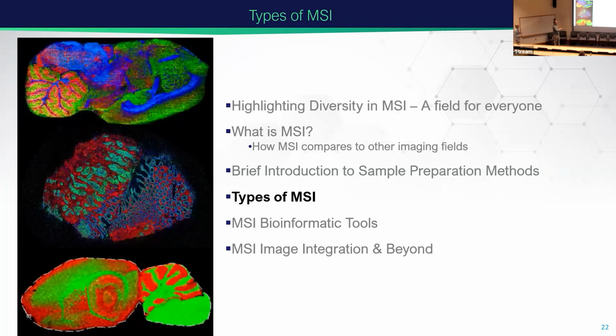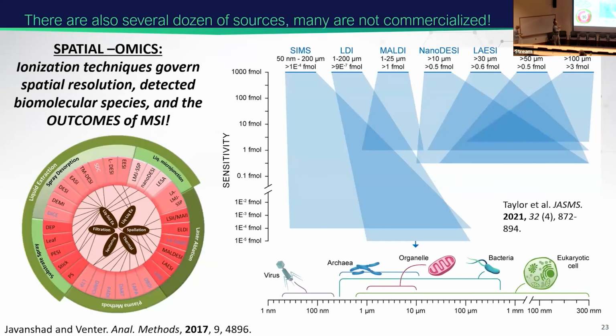So right now, I'm just going to go over a brief overview of different types of mass spectrometry imaging. I mentioned a couple while showing pictures of the instrumentation, and it's always nice to see what the instruments look like. They might be scary or complex for some. I said I was going to throw an acronym zoo at you because, if we think about molecular imaging or even atomic imaging, we have a range of spatial resolution, down to the nanometer scale, especially for secondary ion mass spectrometry and NanoSIMS, which is a big capability here. But we actually have every single one of these within EMSL.